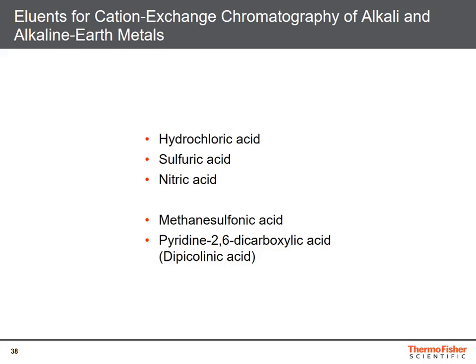The choice of this acid very much depends on the applied detection system. Imagine we would like to separate an aromatic amine, where UV detection would probably be the best choice of a detection system. In this particular case, I would choose an acid with a very low UV background. And whenever I look to this inorganic acid group, of course, I would naturally choose sulfuric acid with a zero background in UV.